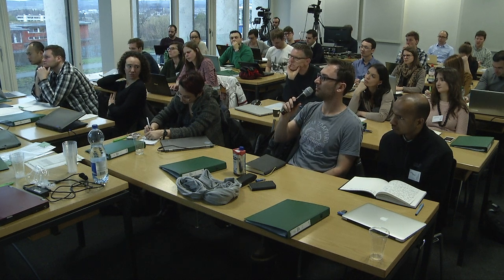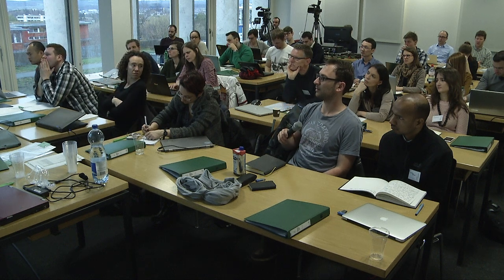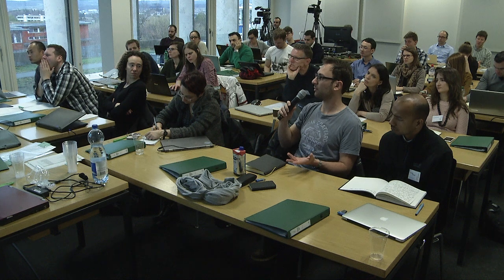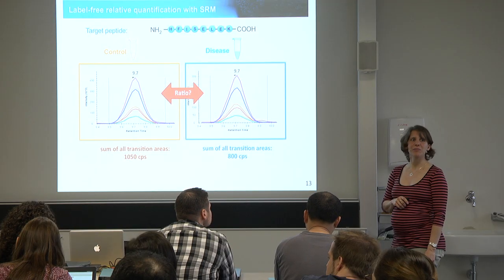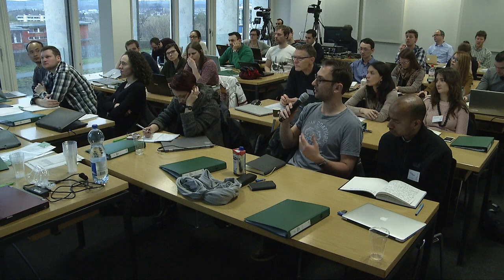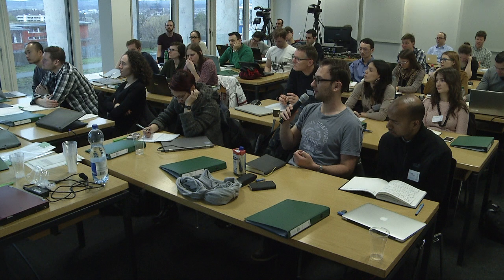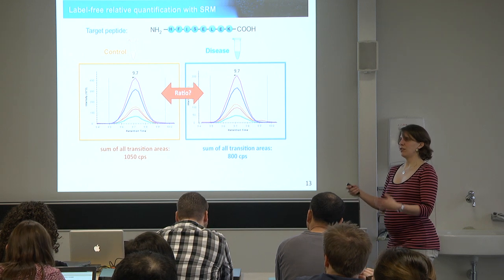Is there a term for the weighted ratio, the first one that you mentioned, a standardized term that is reported in the literature? The weighted ratio of all transitions? No, I'm pretty sure not, but maybe somebody else knows. It can be non-weighted or weighted. It's just what's done mathematically by summing transitions first and taking the ratio.